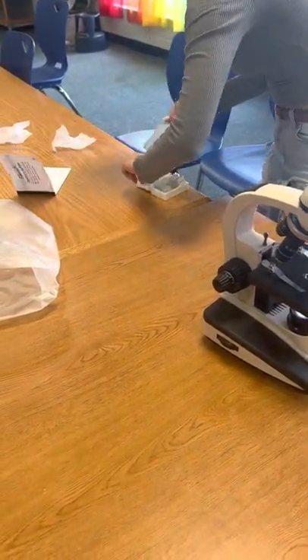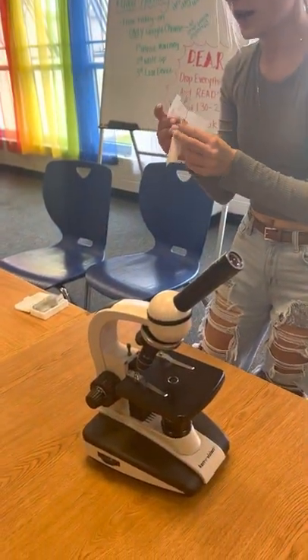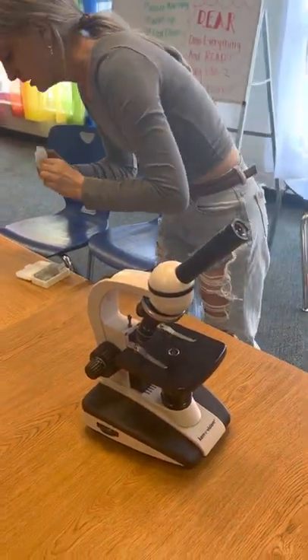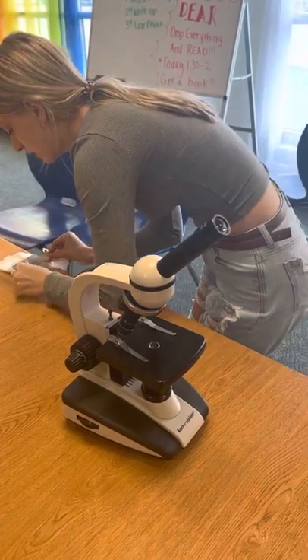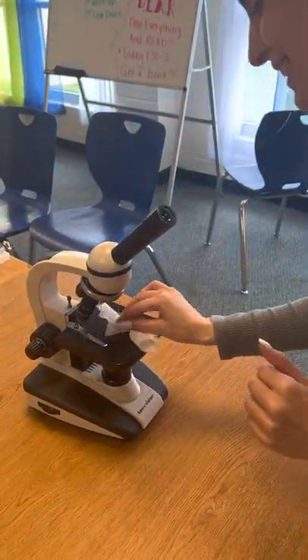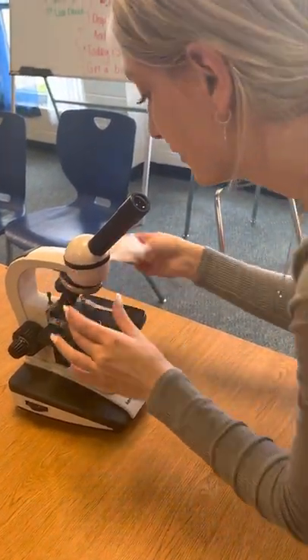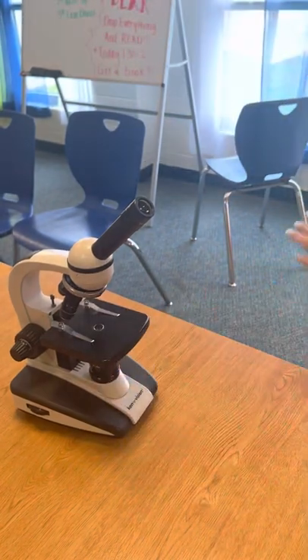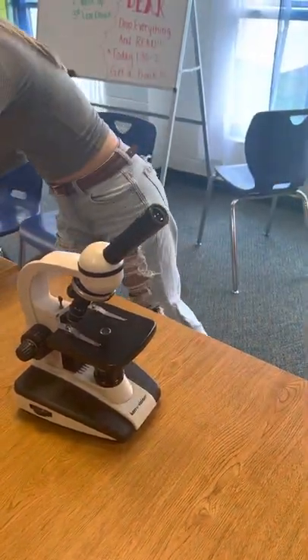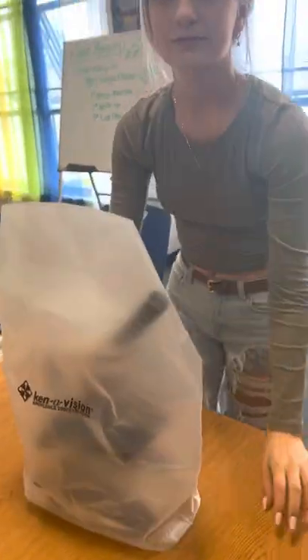I am going to clean up around the slide. Make sure there's no fingerprints left. I'm not going to wipe on the circle. I'm going to place it back in gently. I'm going to wipe down my ocular lens, my light source, and then my objectives. Now I am going to just cover. Thank you.